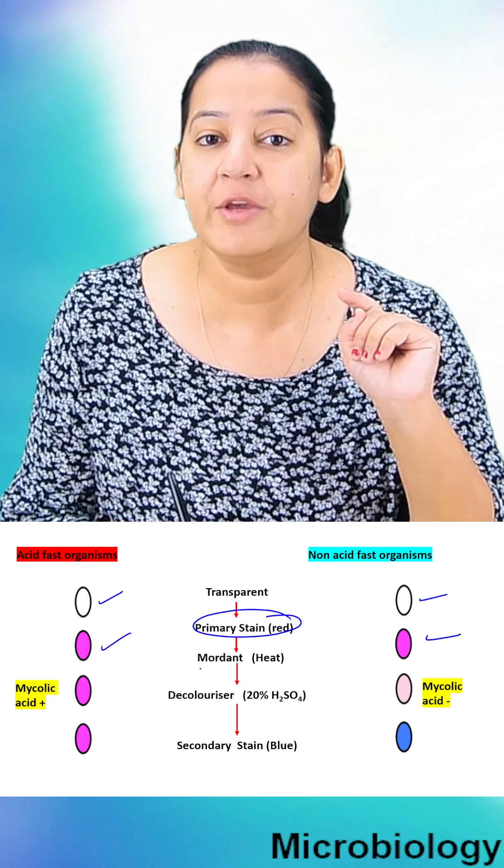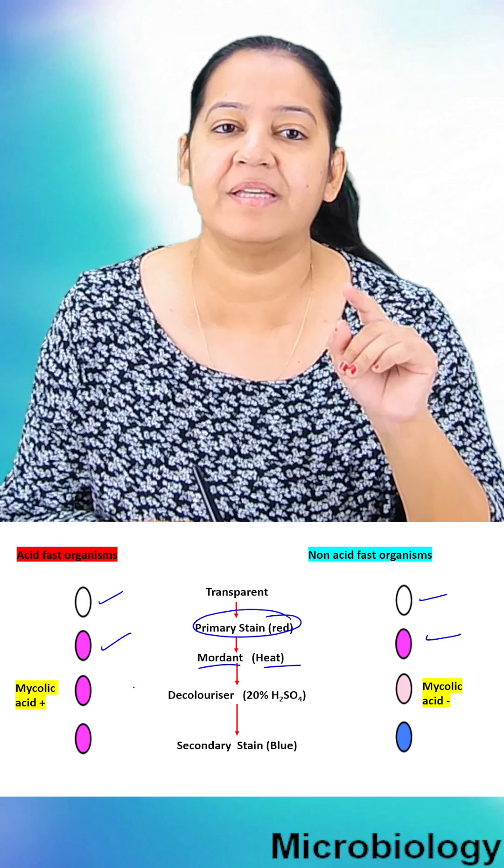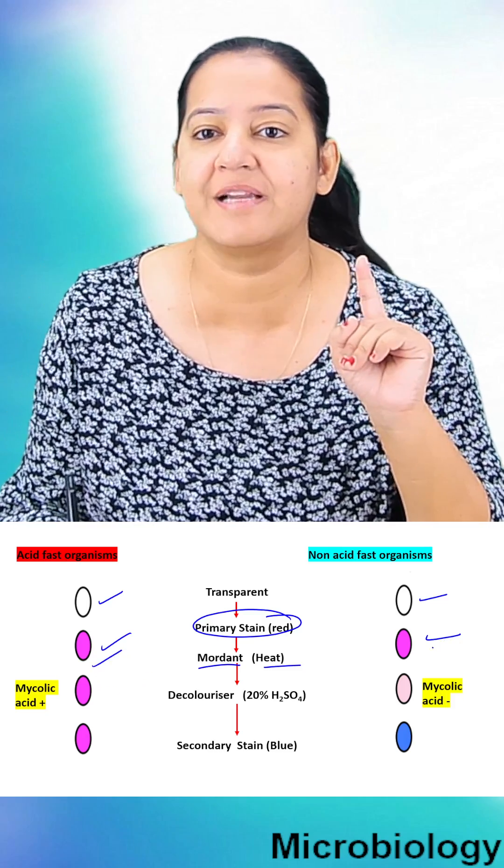The second step we use mordant. It is simple heating which fixes the primary stain. So it is still red.